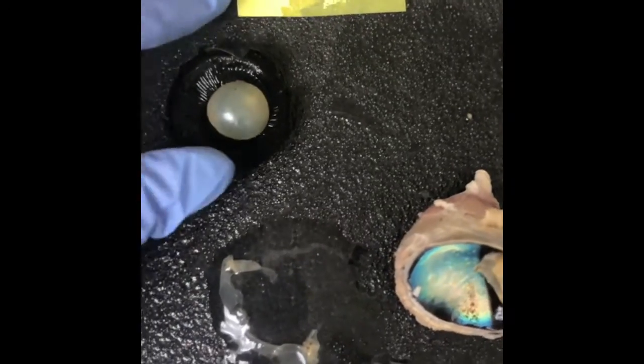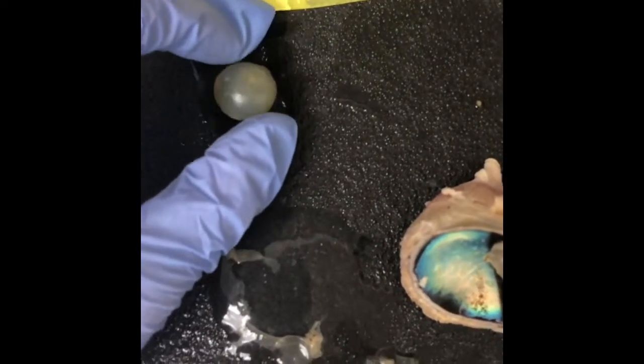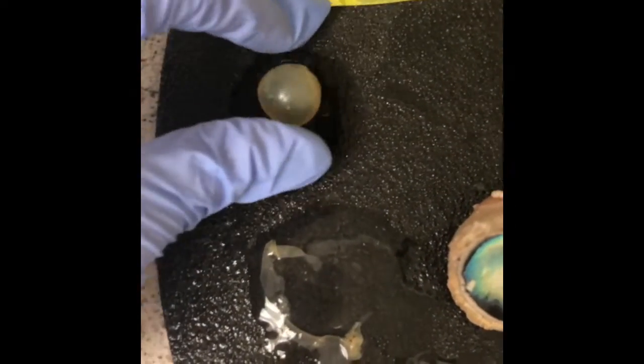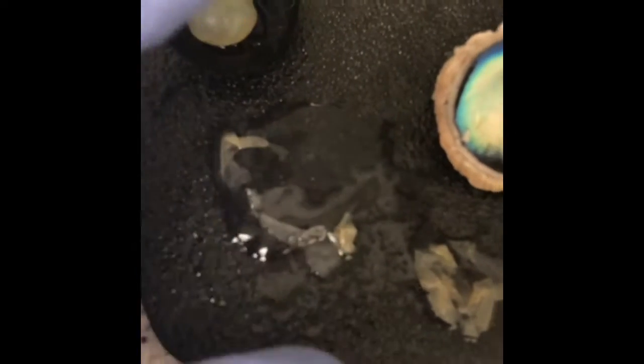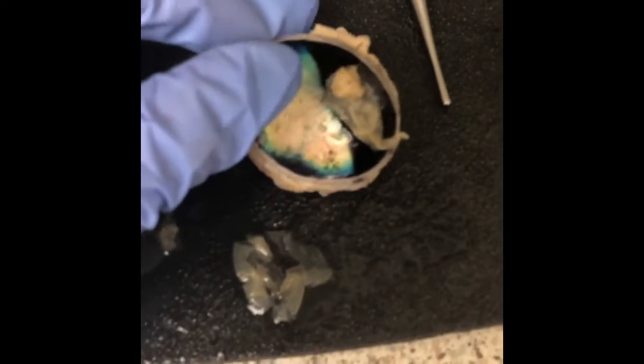There was so much that I learned throughout this dissection. Going into this, I thought that an eyeball was just simple and round. But we have so many different parts of our eyeball that we do not know about, and all of them have different functions. And like this right here, I cut open the eyeball and it just stayed in place until I scooped it out. That is interesting, as well as the tapetum lucidum.